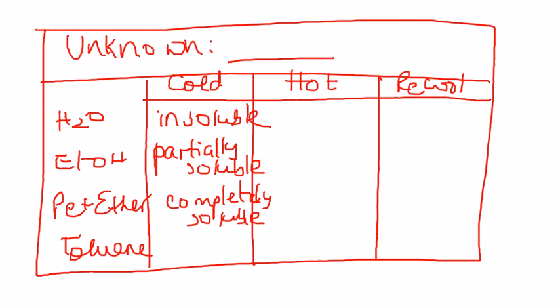Nothing happened to it. A lot of times you will see that the solvent and the solute are not interacting with each other, and a clear indicator of that is that your solid is going to float on top of your solvent. On the other hand, if it tries to interact, it usually settles down, or the amount would lessen a little bit. So you have to eyeball to be able to make that call.